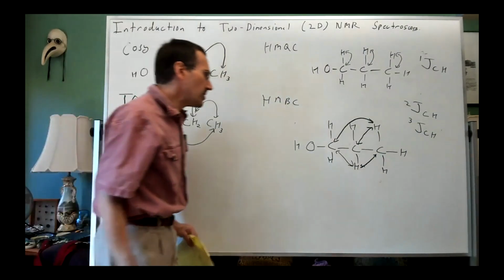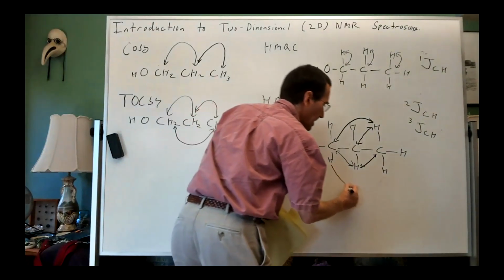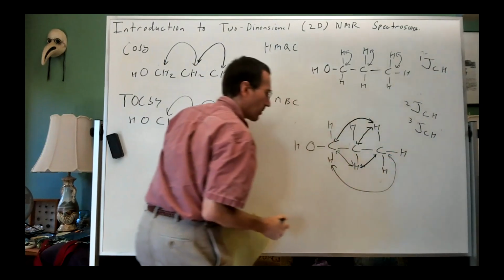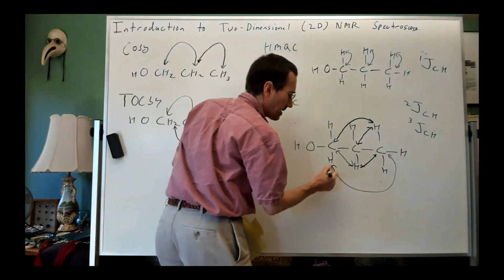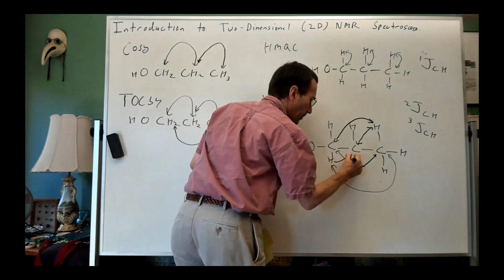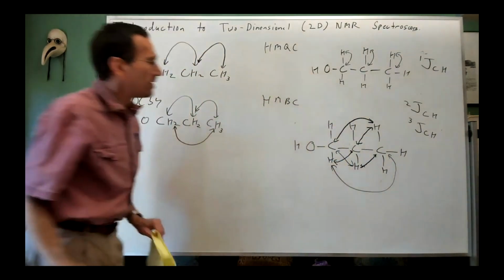And the hydrogen on the methylene group next to the oxygen is correlating with 3 bond couplings and with 2 bond couplings, like so.